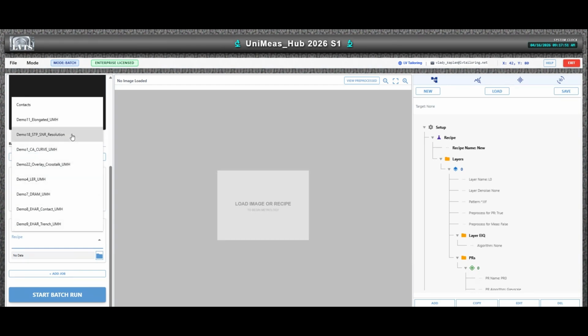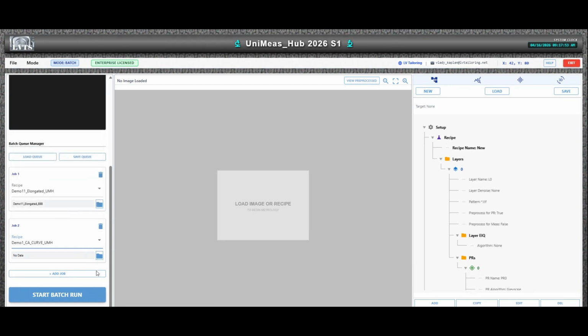paths for template images. To locate the correct files, the engine dynamically maps these relative strings to the active physical batch workspace directory, utilizing operating system commands to normalize file paths seamlessly.